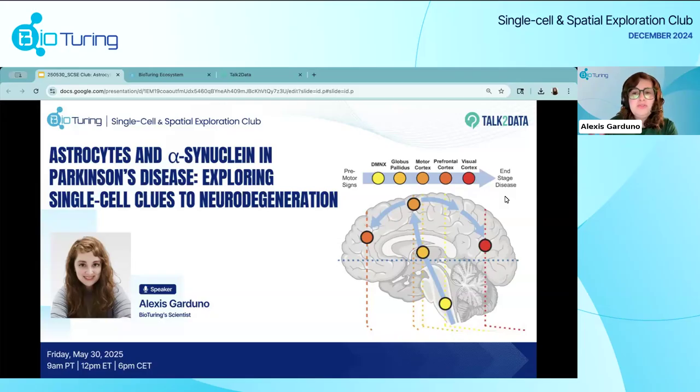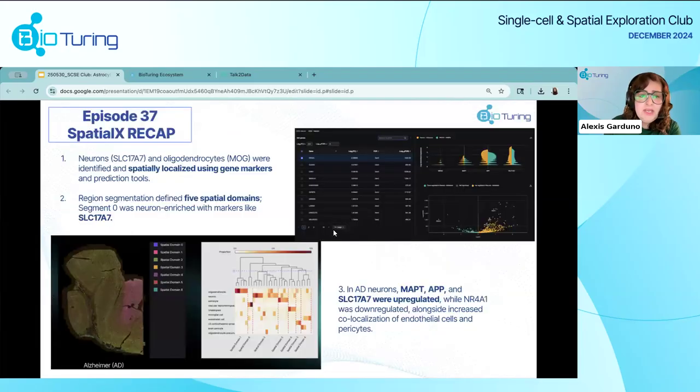We'll utilize a few different features from the Talk to Data version 5 system to look at transcriptional differences, correlation analysis, and mapping out the expression of alpha-synuclein, and whether we in effect see low expression, as in previous studies, and different expression across different regions of the brain. So that is a nutshell of what the case study will be on today.